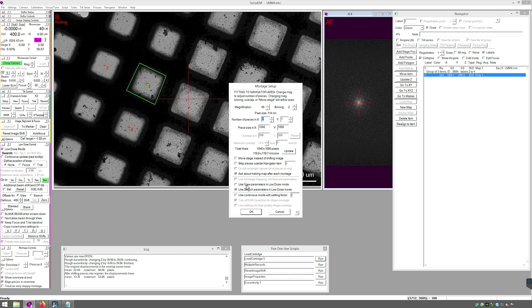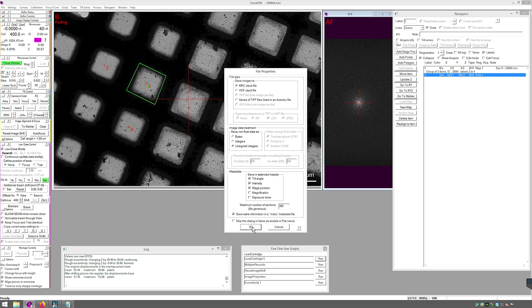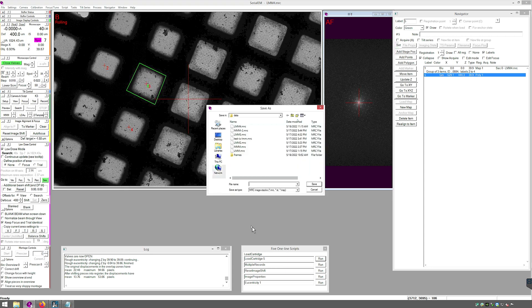From here, click Use View Parameters in Low Dose and make sure Move Stage Instead of Shifting Images is turned off, and press OK. Save as an MRC Stack and save the MMM file.